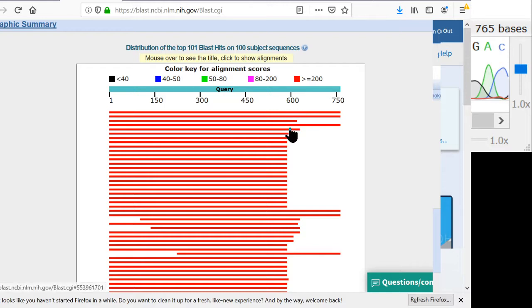So usually when people sequence mushrooms, they use a primer called ITS4 as the reverse primer. So ITS1 and ITS4 gives you about 600 bases. So these sequences here are the ones that used ITS4 because it stopped copying at base 600. Now I used ITS4B, so I get a little bit more data in here. And so it stopped copying over here. So you can see that the top couple query matches here, they have longer sequences, but then they quickly go down to the shorter sequences.